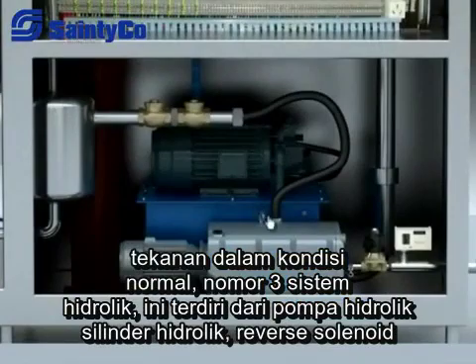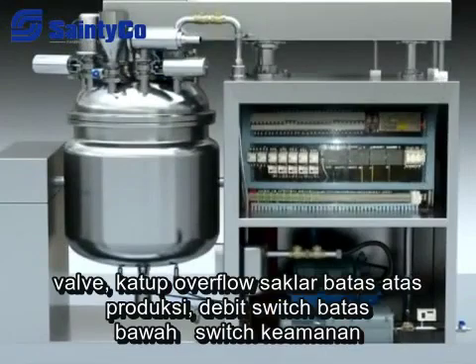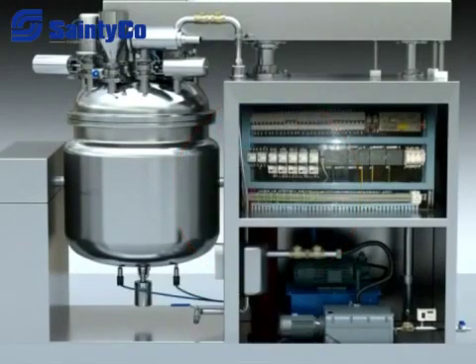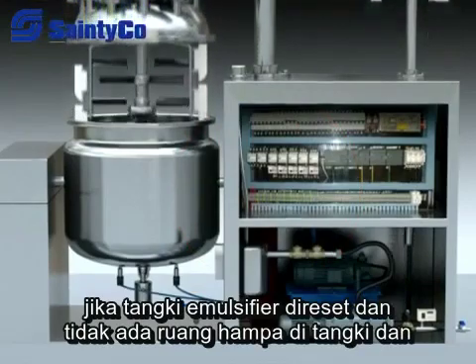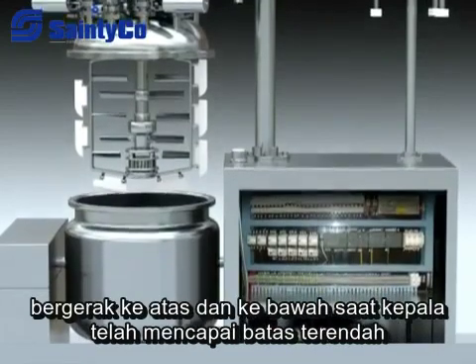The hydraulic system is made up of hydraulic pump, hydraulic cylinder, reversing solenoid valve, overflow valve, upper limit switch, lower limit switch, discharge range, and safety switch. If the emulsifier tank is reset and there is no vacuum in the tank, and the safety switch is in position, then the upper and lower ceiling heads will start to move up and down.